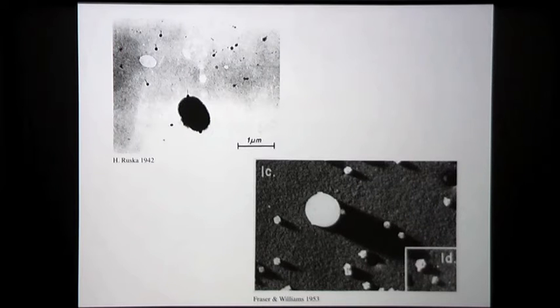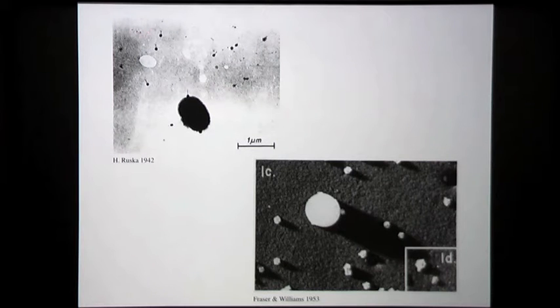In order to visualize these, because biological materials are low atomic weight materials, they don't scatter electrons very strongly. And therefore, you need to provide a contrasting medium, or you used to need to. So in this case, the phage particles have been stained with a heavy metal salt, which has then been washed away just to leave the uranium or whatever, I don't know what the salt was in this case, attached to the biological materials, and therefore it looks dark.